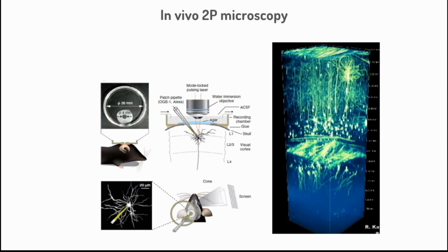Okay. So in vivo is pretty complicated, but not the microscopy itself, but the surgery. You have to do a very special surgery. Normally we do this on mice. I've seen it in rats, but in mice it's much easier because they are small. Normally you have to open the skull of the mouse. We call this the cranial window.